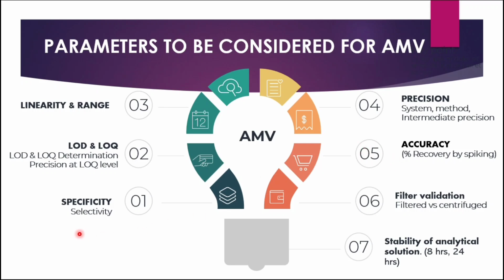Okay. So continue. LOD and LOQ determination, method precision at LOQ level. You have to consider linearity and range. I am not elaborating each and every step here because you all are aware of analytical method validation and I am trying to make another session on analytical method validation.